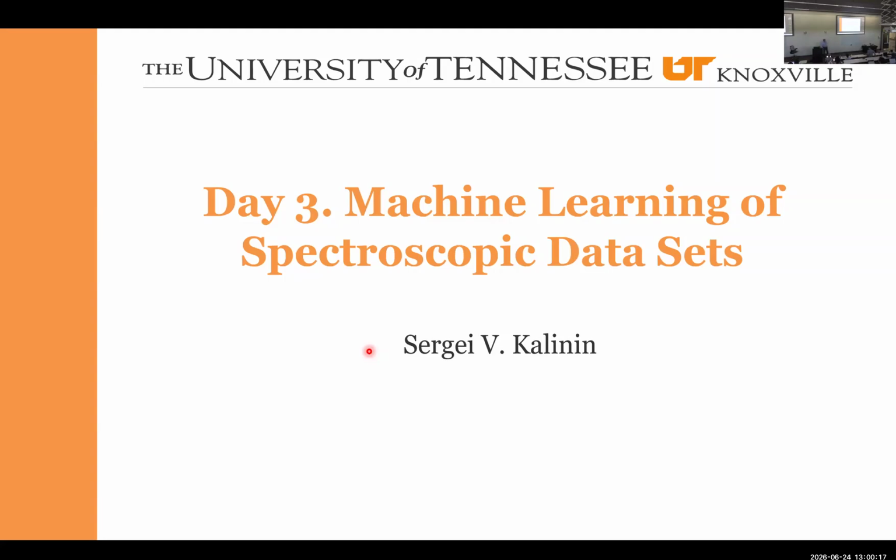We are going to talk about how to use machine learning for the analysis of data in electron microscopy. One very important thing is that when we started to work in this field, along with several other groups 20 years ago, we had the data. We barely had the computational capabilities to store the data, because analyzing even a relatively modest EELS data set on a desktop PC at that time was a problem.